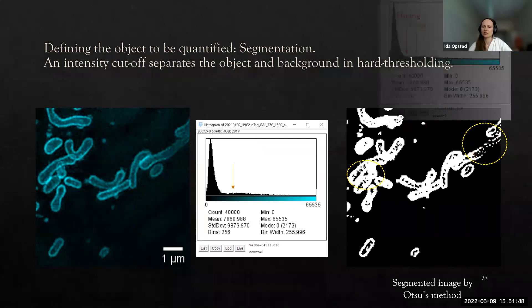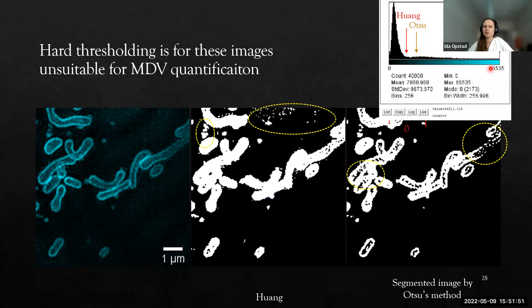We can change the threshold a bit using different semi-automatic methods called Otsu's or Huang. Here we change the threshold a bit down so we fill the mitochondria better, but we also get a lot of noise or artifacts in the background. It's not easy to see here, but it's just some reconstruction artifacts which show up as vesicle-like things.